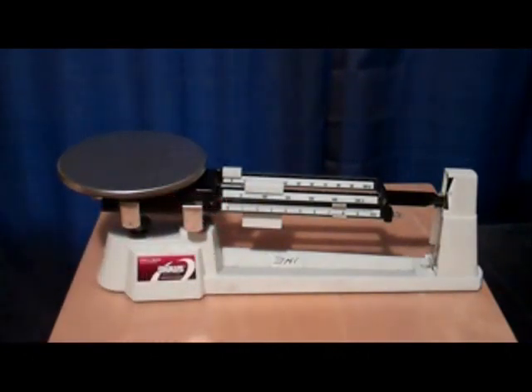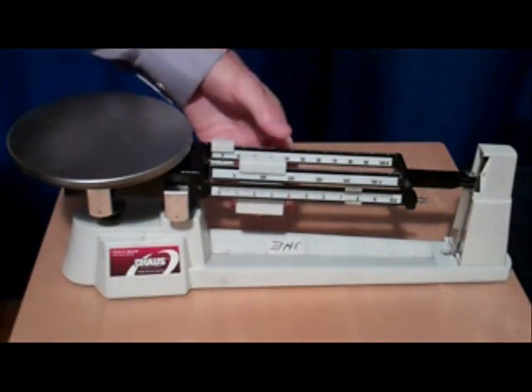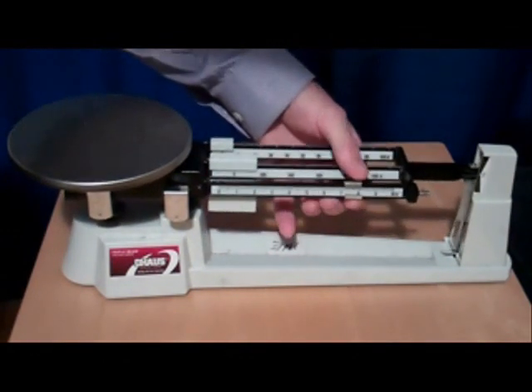The second step in preparing the triple beam balance for use is to move all of the riders to zero. Move each of the riders back to zero.